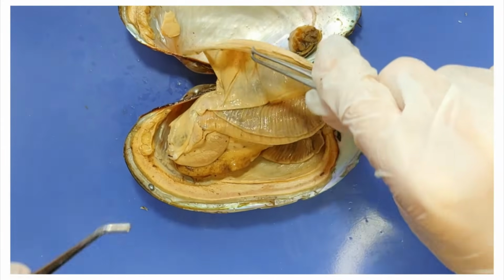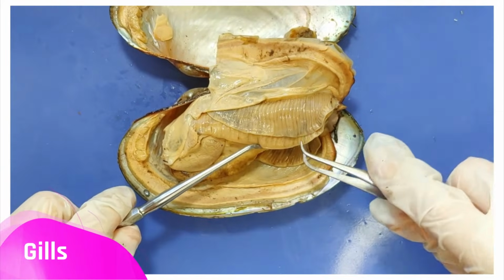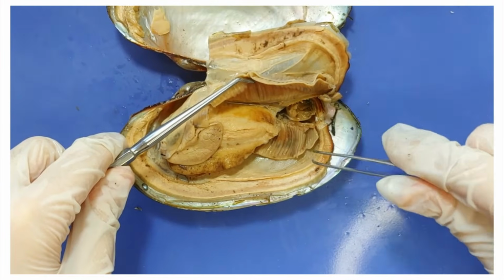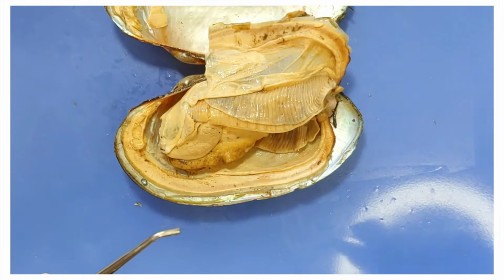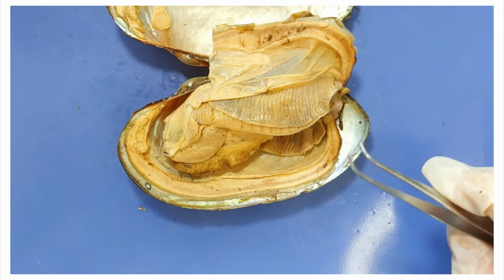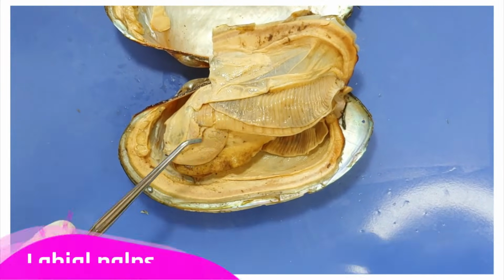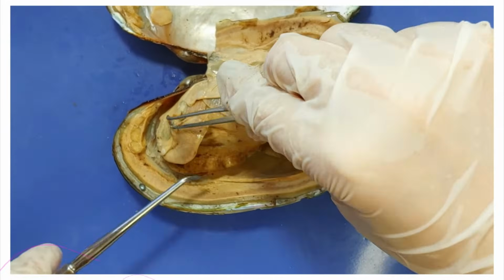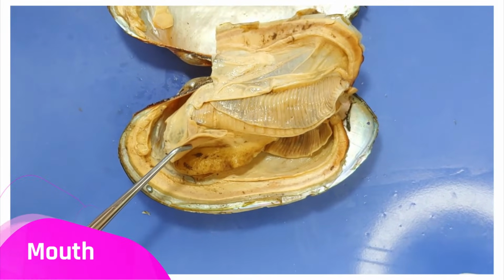Now, when I lift the mantle, these flaps you see here are the gills. There's one on this side and one on the other side, right here. These gills serve the two important functions of breathing and eating by removing oxygen and food particles from the water. These food particles then travel to the labial palps, right here, which pushes the food into the mouth. The mouth should be somewhere below the labial palps, and if we're lucky, we'll see it.